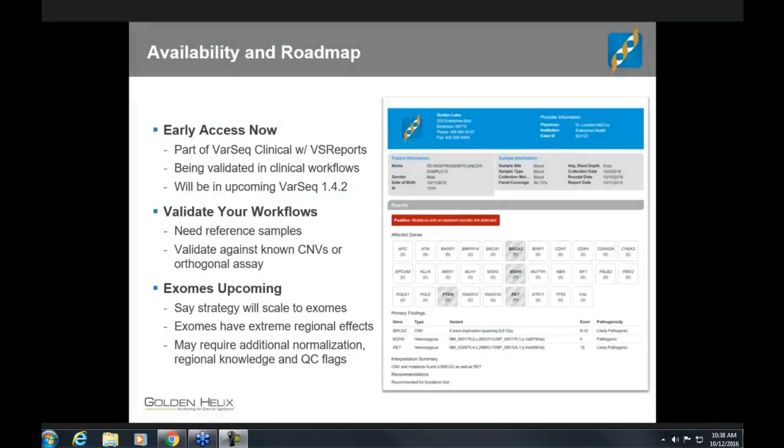All right, thanks, Nathan. Fantastic overview. So hopefully you guys, just by watching this and seeing a little bit of the high-level description of the algorithm and how it works in VARSeq, get a sense of what the application is that we're trying to target here. We think that there are unique things about our algorithm, mostly in the ability to include multiple metrics. So we're not just looking at a z-score, but we're looking at the z-score plus a ratio, plus any overlapping variants if there are any. And so that is something quite new and novel, and we find that all those extra metrics do essentially help with this tunable sensitivity precision trade-off. And so that's what we are evaluating in the context of these gene panels.